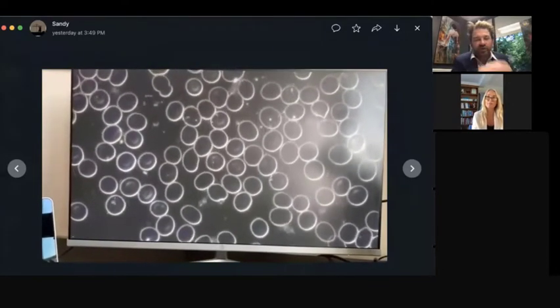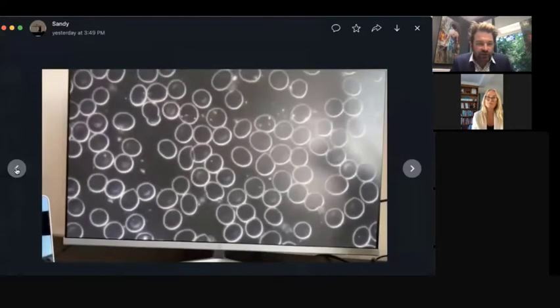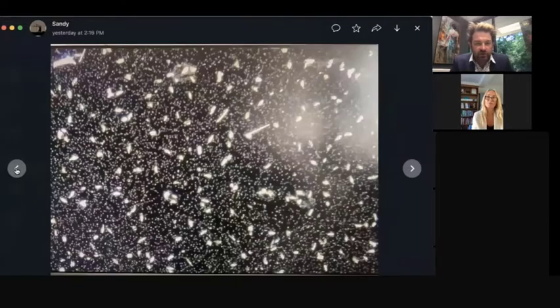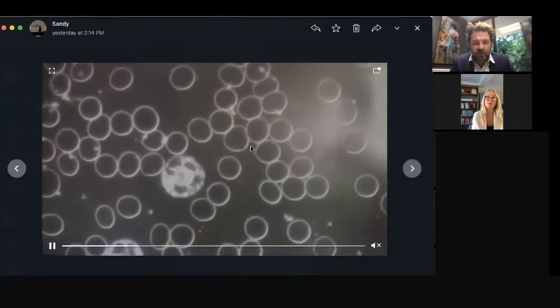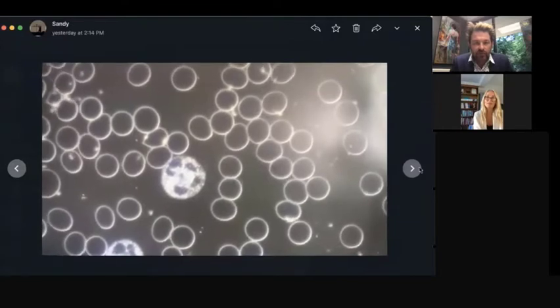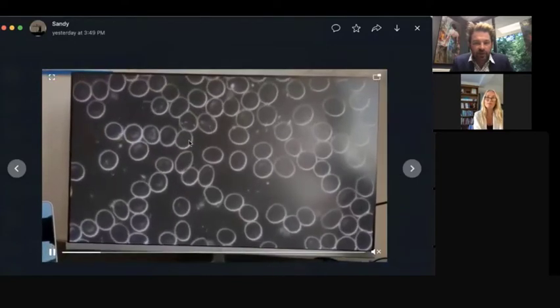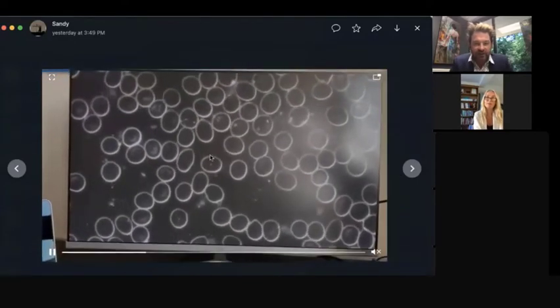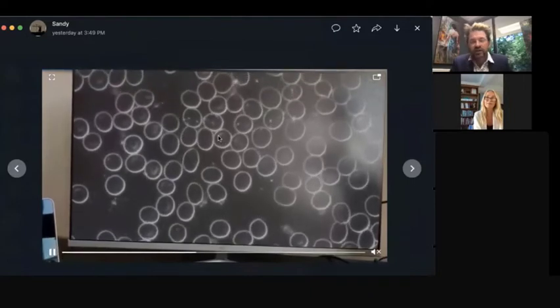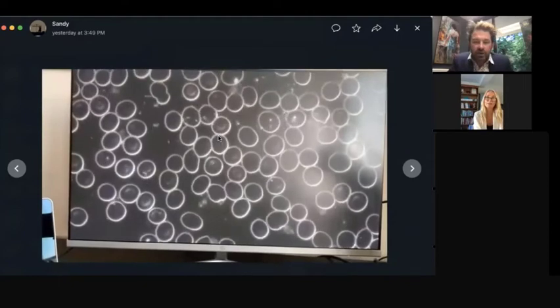And as you were touching on the membrane efficiency, you can see that if we go back and forth, let me go back here. When you look at the membrane of these little red blood cells, they're very healthy, but when we go forward, you can see that they're markedly stronger, and that's a measurement of their zeta potential, right? As far as the membrane energy and such.